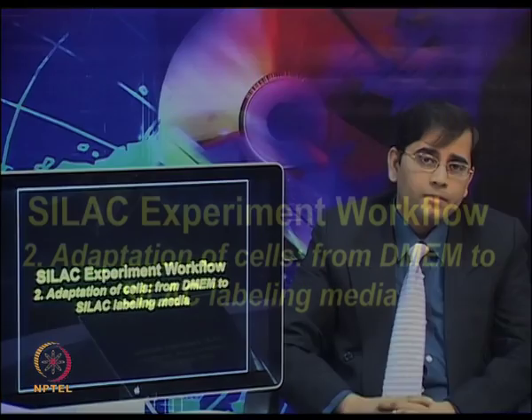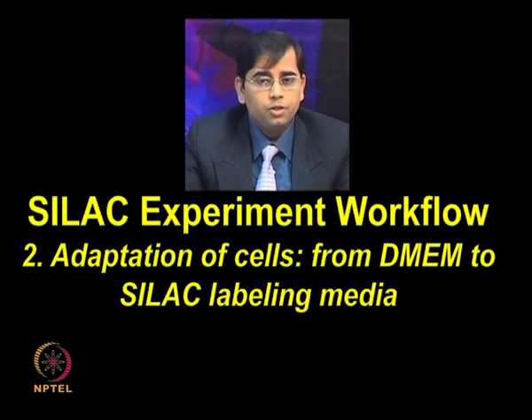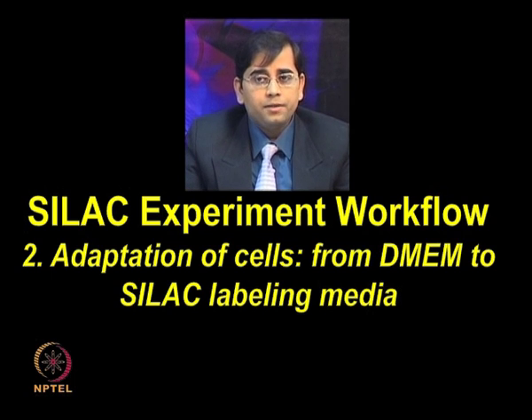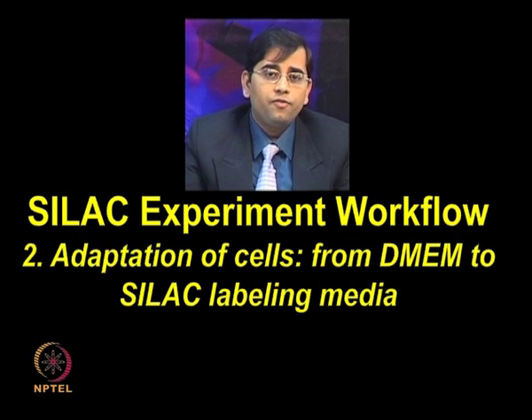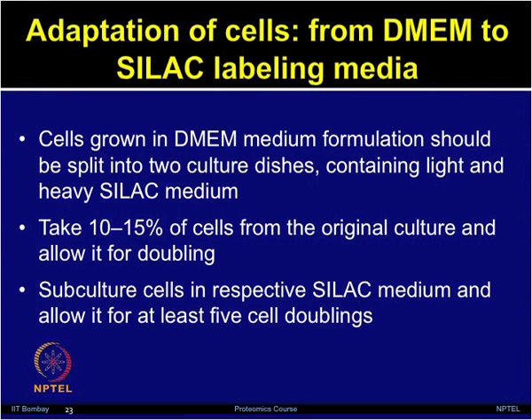In the SILAC experimental workflow, let us discuss about second point, the adaptation of cells from the DMEM media to the SILAC labeling media. These cells need to be adapted due to the slight differences in media formulations. So, if the cells are grown in DMEM medium, it should be first split into two culture dishes containing a light and heavy SILAC medium.